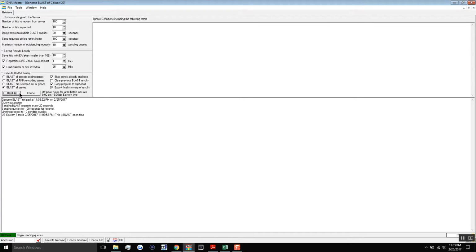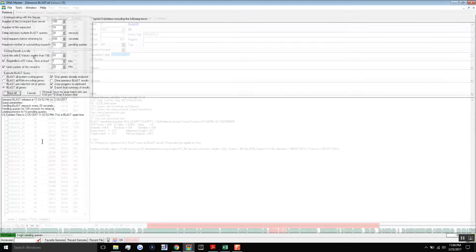So we're gonna hit blast all, and it's gonna commence the blast result, and then we'll have to wait till it's done. This may take a little bit of time, definitely. So if you are doing this on, you know, a school computer or something, you may have to leave it running overnight, or something like that. It's going to take at least a couple of hours depending on how many genes you have.